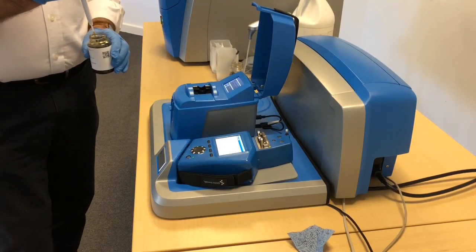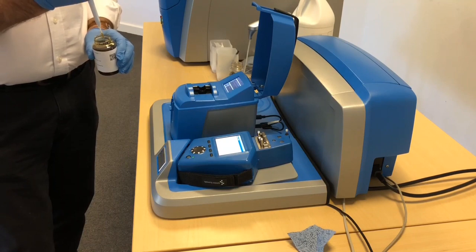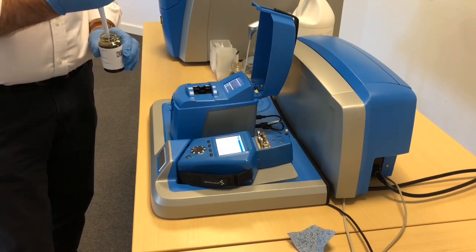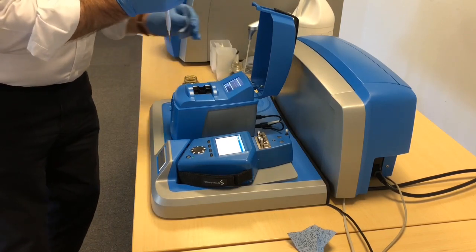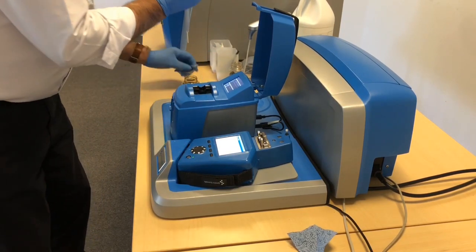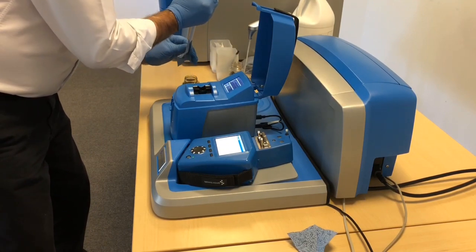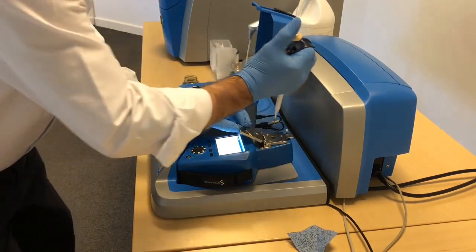Okay, we've already measured the wear metal content of the sample on the spectrometer. Now we need to do the viscosity, oil chemistry and particles. So I'll draw up a sample with the 60 microliter pipette. I'll load it into the viscometer, which is ready. I'll take another amount for the infrared and load that into the flip top cell.